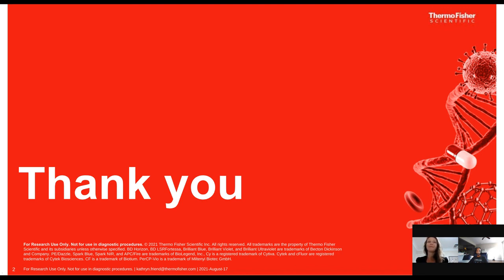All right. Thank you, Kathryn. Do you have any final comments for our audience? Certainly, if you wanted to look at NovaFluors in comparison to other fluorophores, there is a great table online. I probably didn't mention it in the talk, but there is a fabulous table online. If you just Google NovaFluors, it comes up with the Thermo Fisher website. There's a fabulous table that compares separation indices of a number of different dyes along with NovaFluors. And so you can see the relative brightness of NovaFluors in relation to other fluorophores. You can also see where they fit into the spectral space as well.